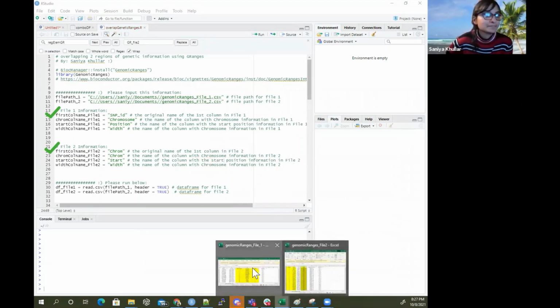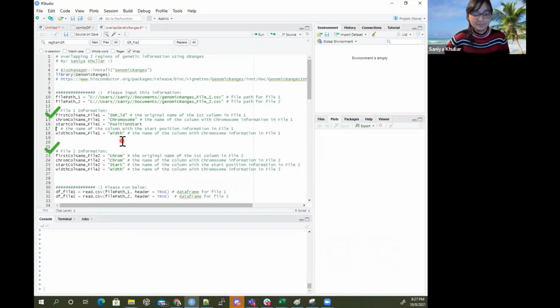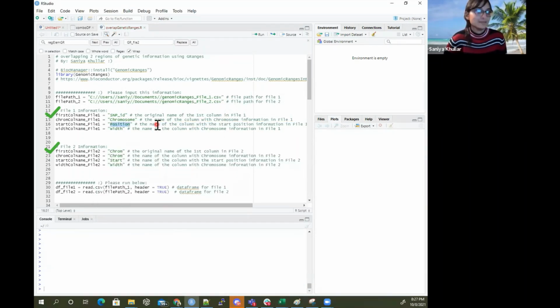Okay, great. So that's what position is, just a starting position. I call it position. You can call it whatever. If you call this position start, for instance, then you can just change this to being position start, like that. If you've named it like that, then you can do that. We're just going to go back to the way it was.